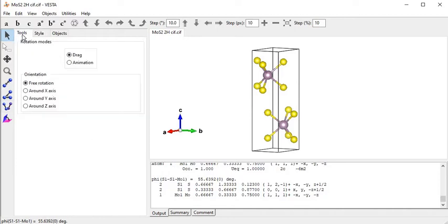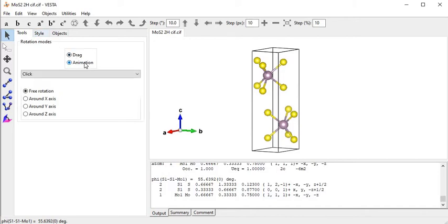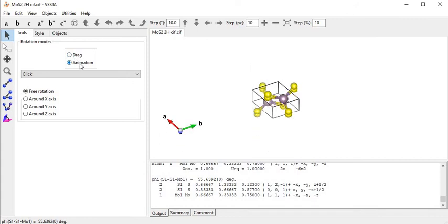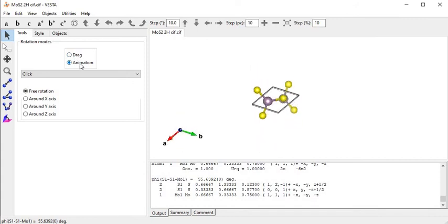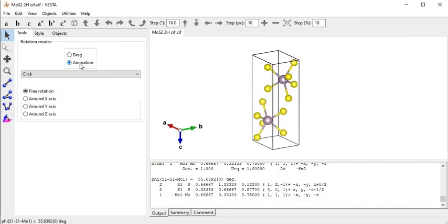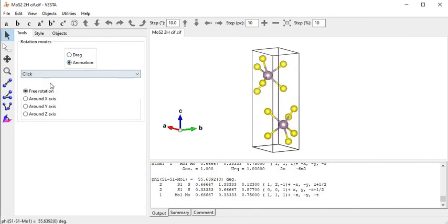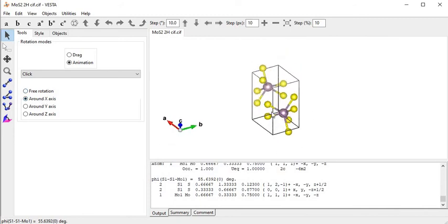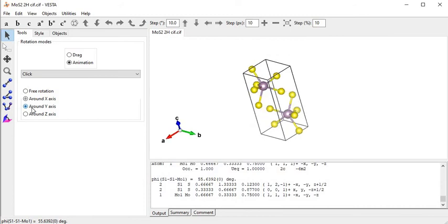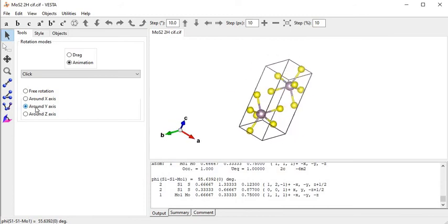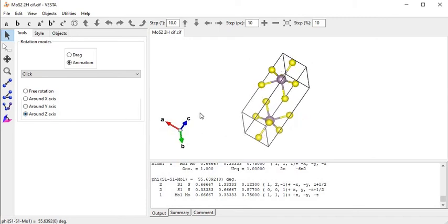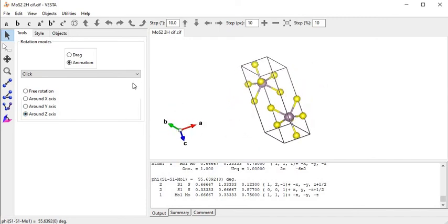Now coming to Tools. Under animation, as we click the animation part, the crystal is moving around one axis. If we click 'around x-axis' the crystal moves around the x-axis. If we click 'y' the crystal moves along the y-direction. Click on 'z' direction and the crystal moves along the z-direction.